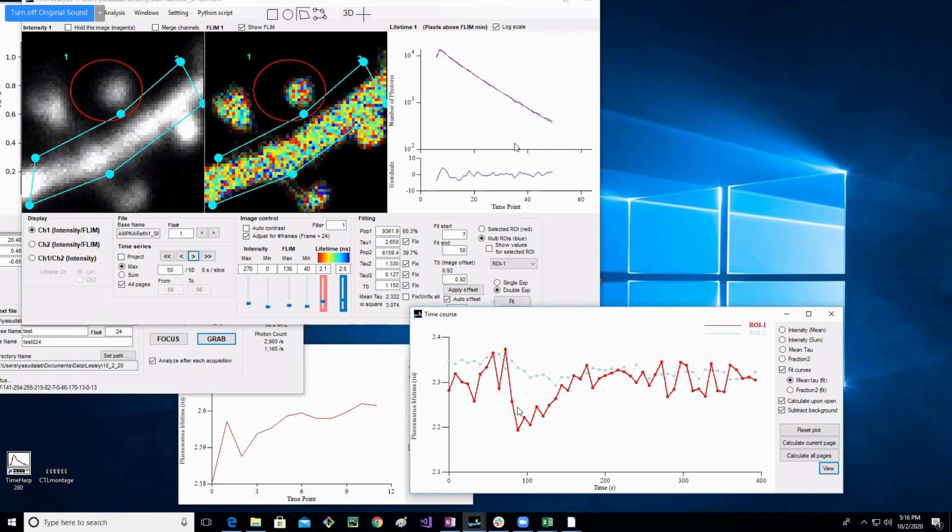I think you guys got a pretty good idea of everything. And once you have actual data, the first time you do analysis, it's good to go through it with your mentor or with me or someone, just to make sure that you're doing it correctly. But it's pretty easy. We didn't talk about things like background subtraction, but for most things, that's not really important for what we're doing.